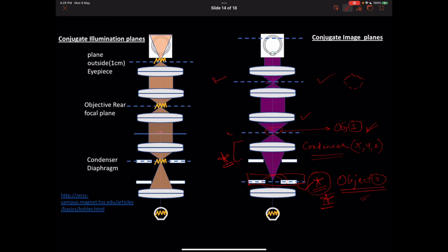Now, this is a tedious job that you have to do every time you turn on the microscope. So why not actually fix your condenser lens and make your life easy? Hold on for that. We will answer that very quickly towards the end of the video.